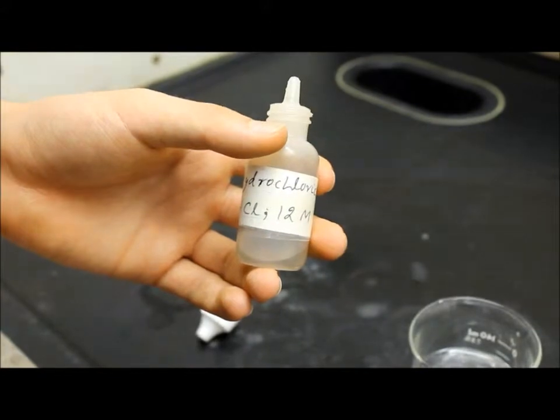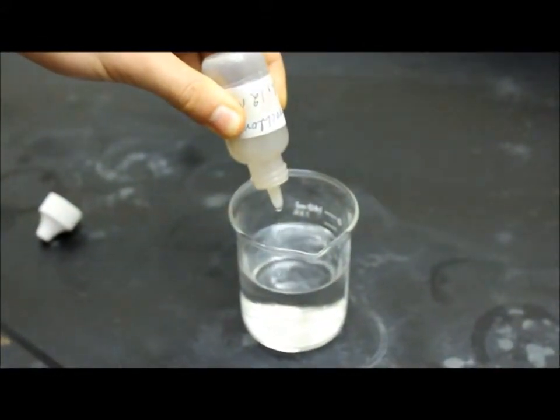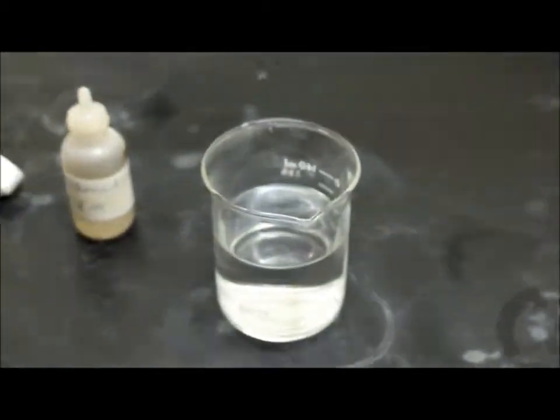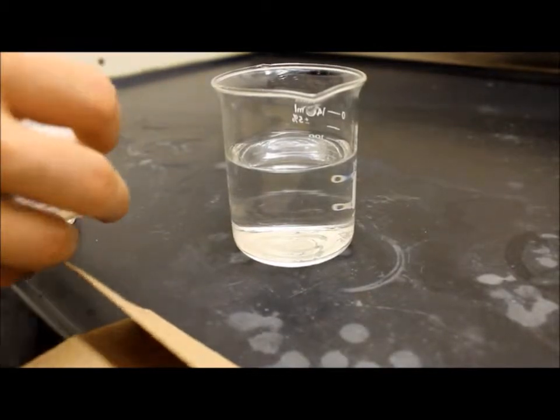Now, move to the fume hood and carefully add 10 drops of 12 molar HCl. Be careful because the acid is highly concentrated. Finally, add a scoop of soluble starch and stir it to complete solution B.